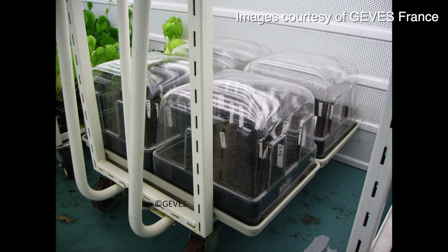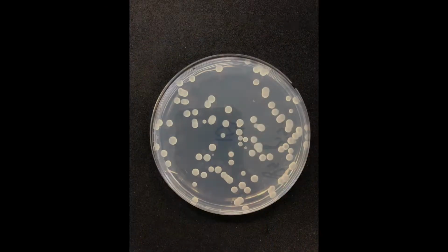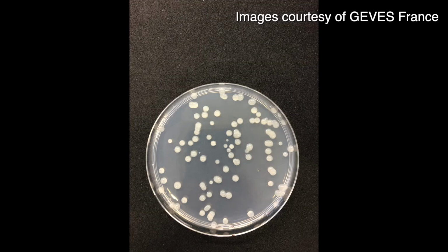And so the aim was to improve that method with what we wanted to use as a PCR identification step to be able to have a result, the negative results, much quicker. So with a PCR result validated, we wanted to be able to say, okay, some isolates were completely negative, and then the suspect isolates, we could then continue and confirm that positivity with the existing pathogenicity test.